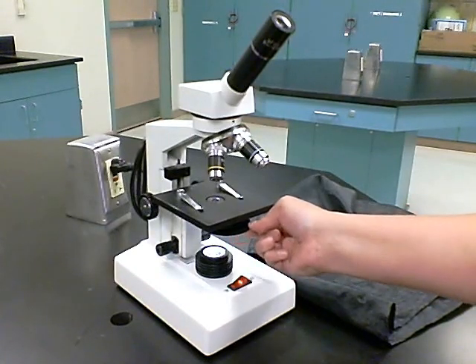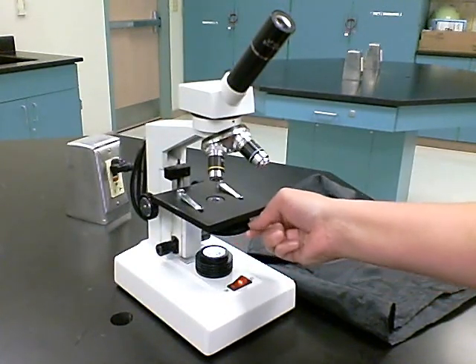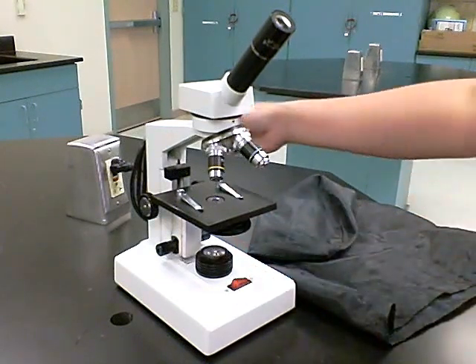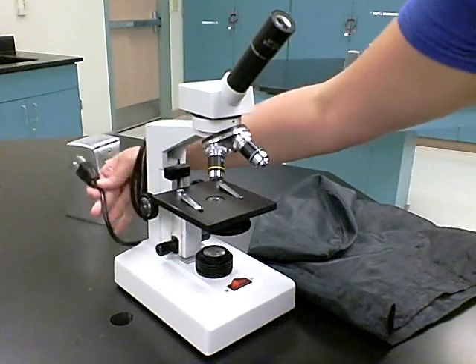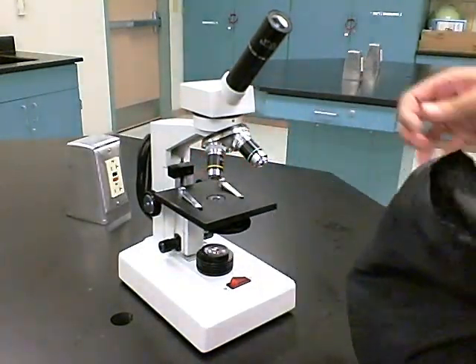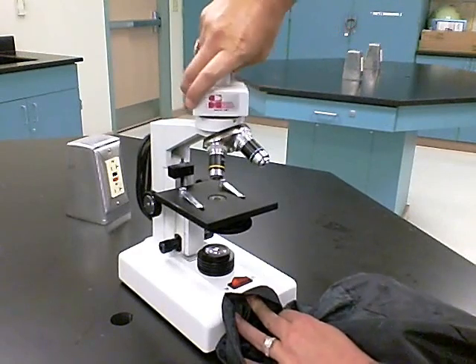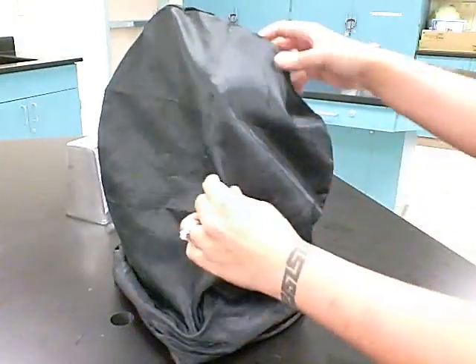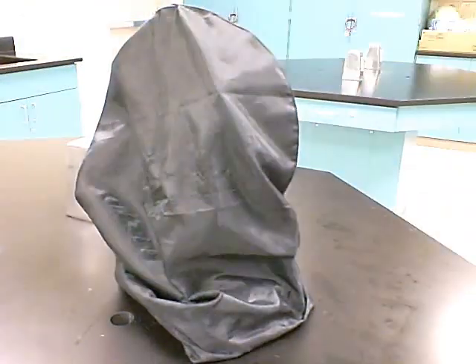Now you want to make sure to return your diaphragm to the lowest position, indicated by the size of the circle, and turn your light source off. Of course, unplug and wrap your cord, and use the cover to cover up the microscope. You want to make sure to turn your ocular around just for saving space, and make sure to cover it, which is going to keep it clean of any dust or debris.